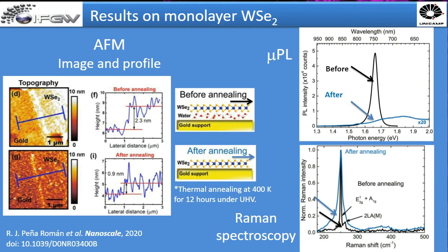So, of course, it would be interesting to look deeper and have a spectroscopic signature of the water, but water is really the best suspect, because it's present on all these kinds of surfaces since they are prepared in ambient conditions.